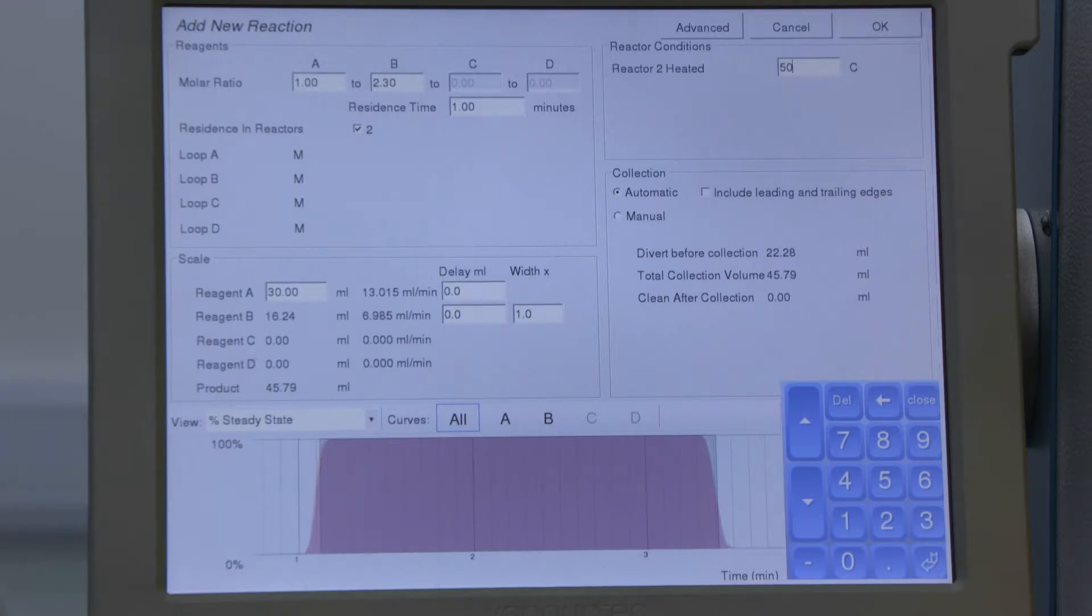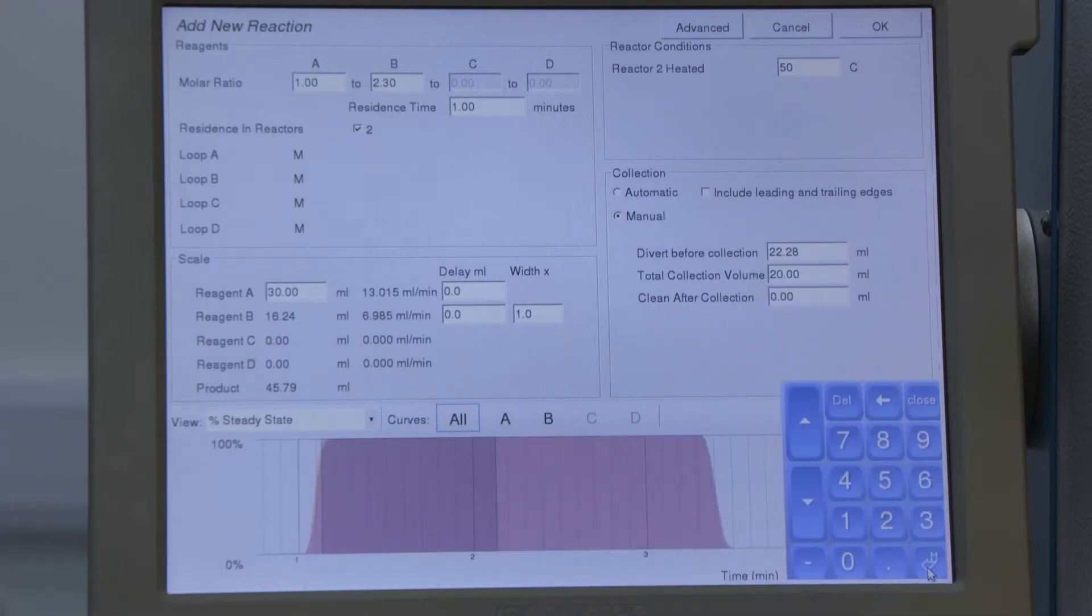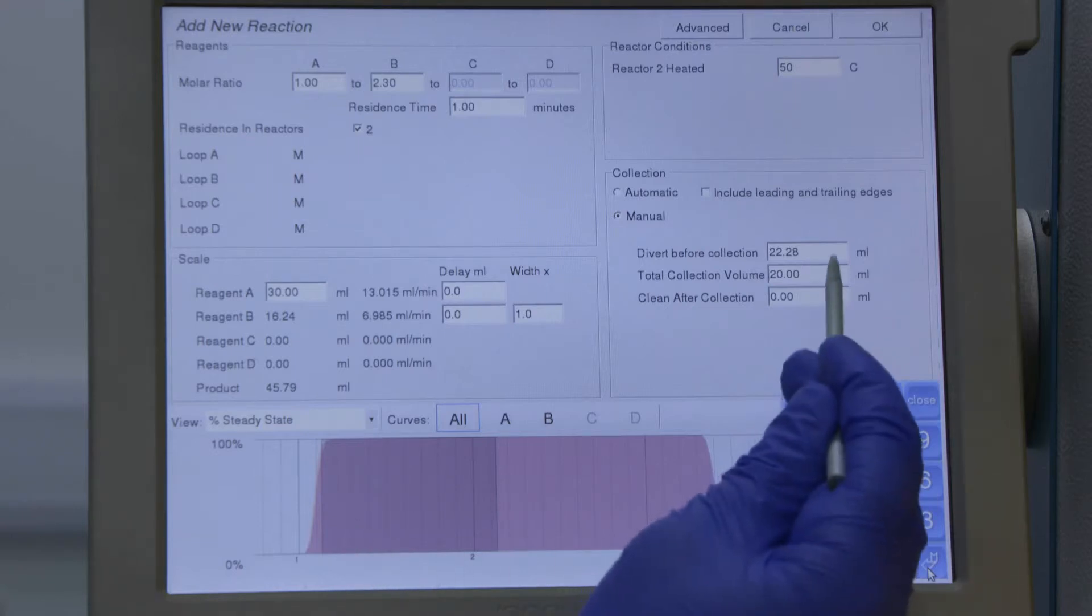I can also let FlowCommander control how to collect my product. For this experiment I want to enter a specific volume. So I'm going to use the manual tool and tell it to just collect 20 milliliters. I can also use this shaded region as a guide of where in my steady state it's going to be collecting. I'm going to move it.